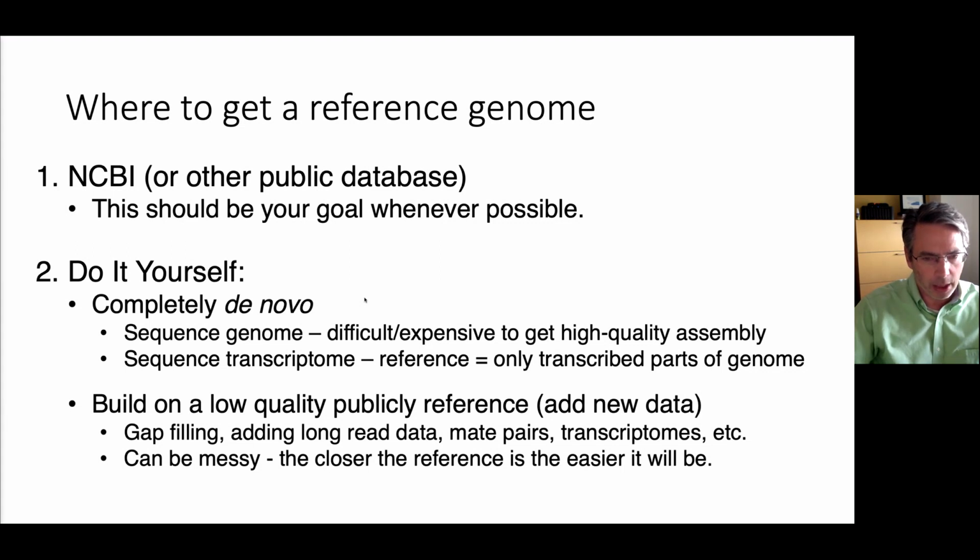And the problem with PacBio, remember, is that it has a high error rate. So if you couple that long read but high error rate with Illumina data, which gives you tons and tons of reads and a low error rate, you can use the long read PacBio as a scaffold and then do read mapping to line up the Illumina data to fix all the errors. So those are some strategies. Making a de novo assembly is considerably better than it was a few years ago, but it's still not cheap and it is laborious. The assembly part can be tricky.